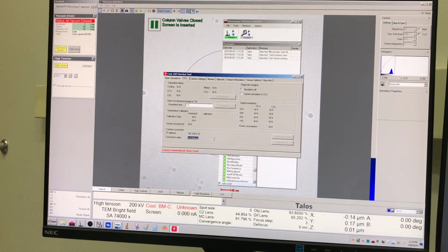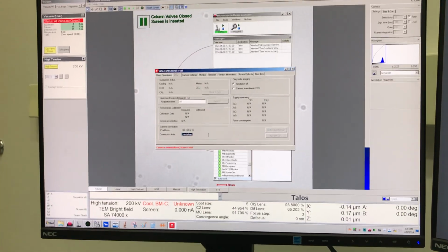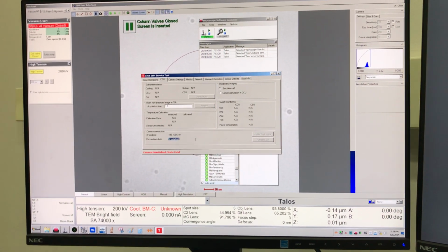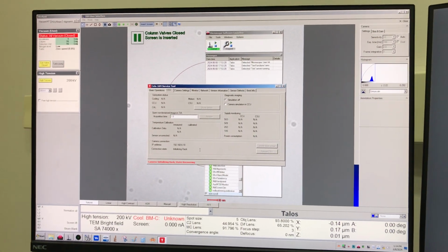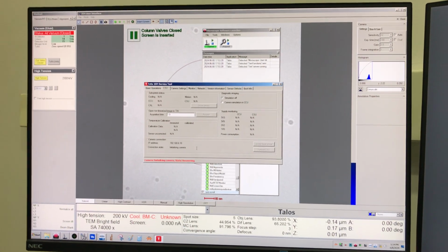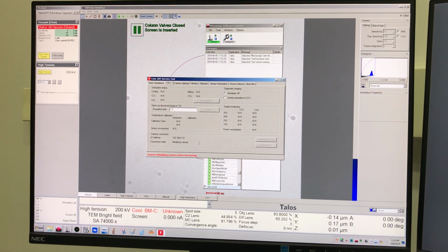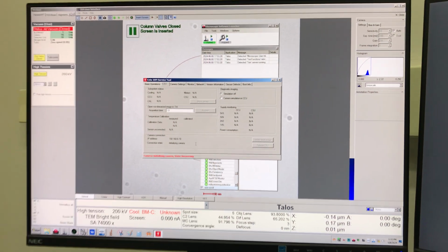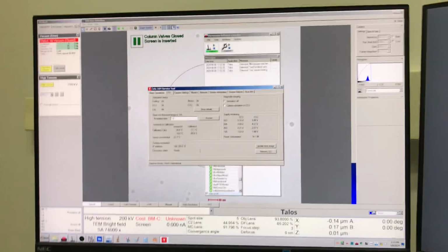This process is identical with the TEMs. The same thing with the service tool. You do the same thing. What's a little bit different is rebooting the boards after you have the water interruption. But this is identical with the Ceta camera. All right, so now it's saying we're initializing and the state is now recovering, so we're getting there. Okay, perfect. And it says operational.